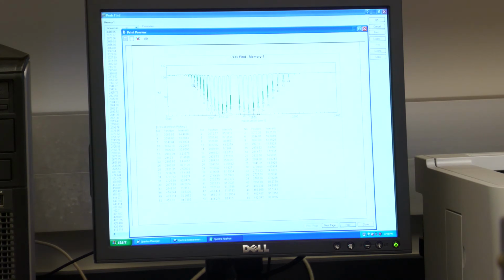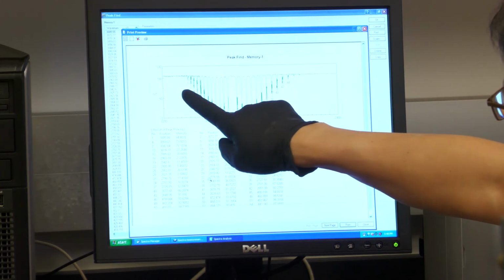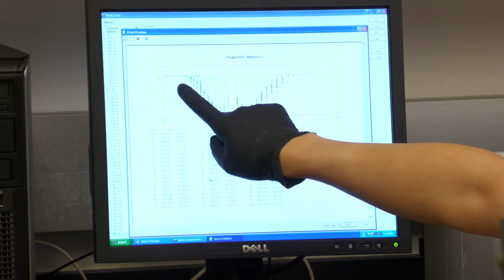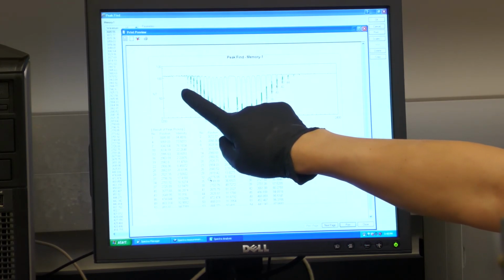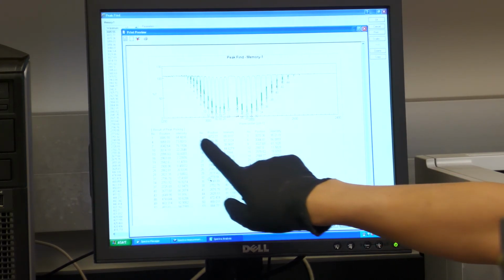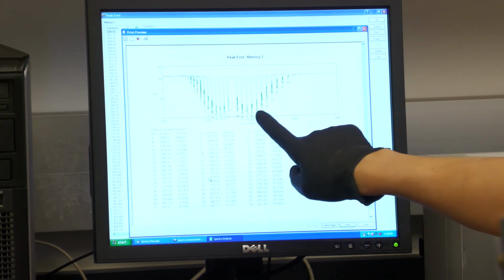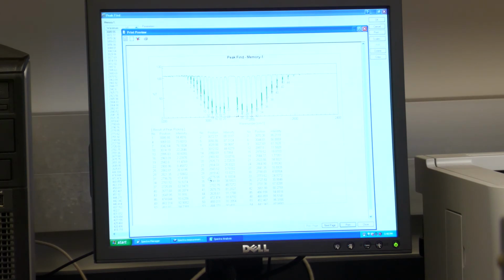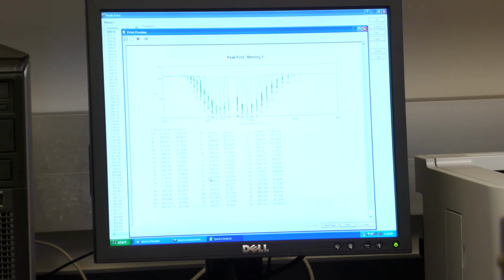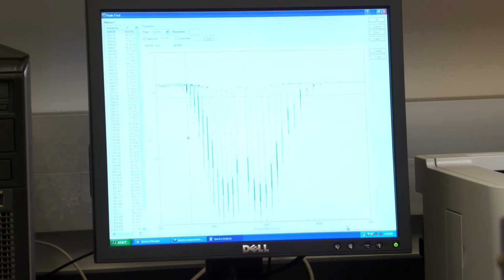Because starting from the second one, that is the high peak. Because you have so many data points, it doesn't matter if you drop 1 or 2, okay? You're starting from 2. 2, 4, 6, 8, 10, etc. All the even numbers are what you want, okay? Because they compare with HCl35, okay? So this is the one, after you get this one, you print it, okay?